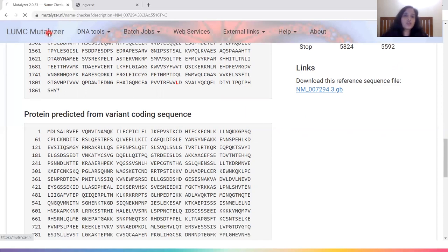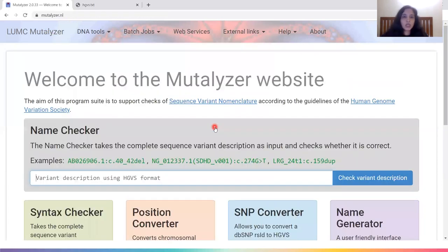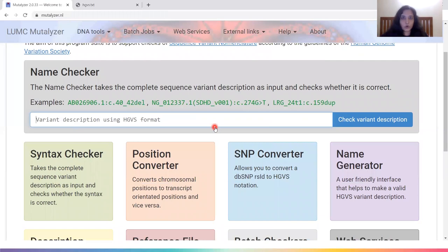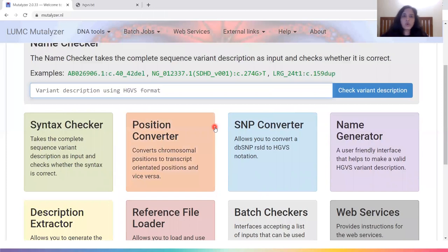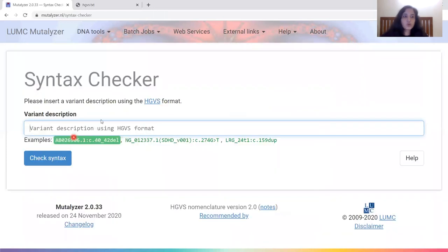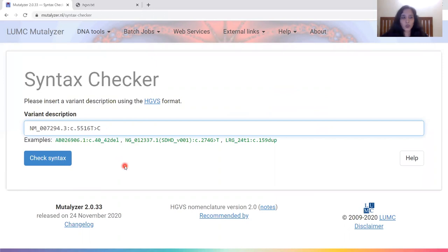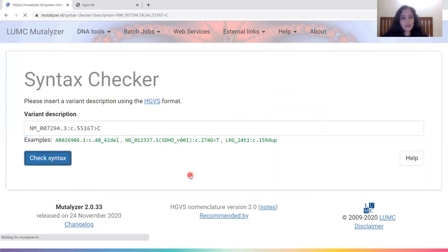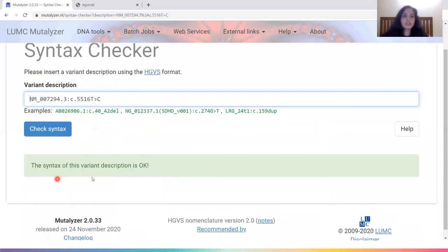If you just wanted to check whether the syntax of your NM or NC ID is correct without needing further variant information, you can simply go to the syntax checker tool. What this tool does is tell you whether your syntax — not the variant itself — but the syntax is correct or not. You click on Check Syntax and it will tell you that in this case the syntax of this variant description is absolutely fine. In case of an error, it would highlight it with a caret and tell you what the error is.